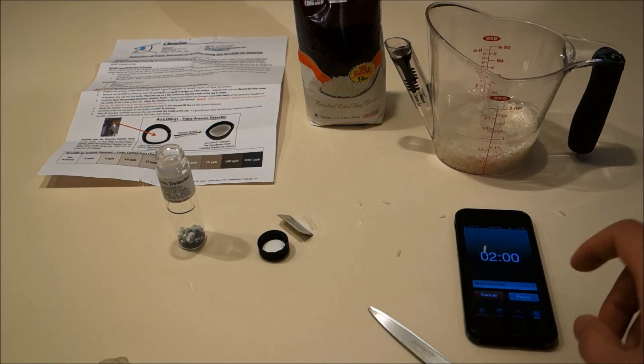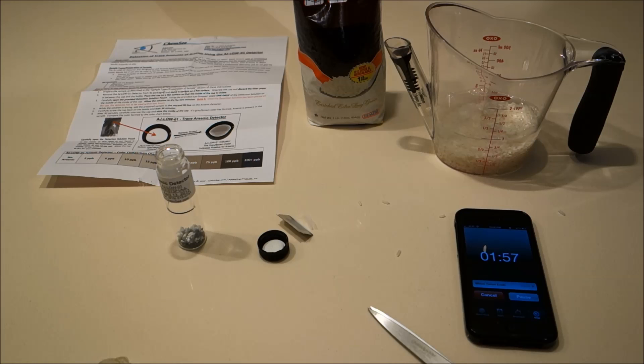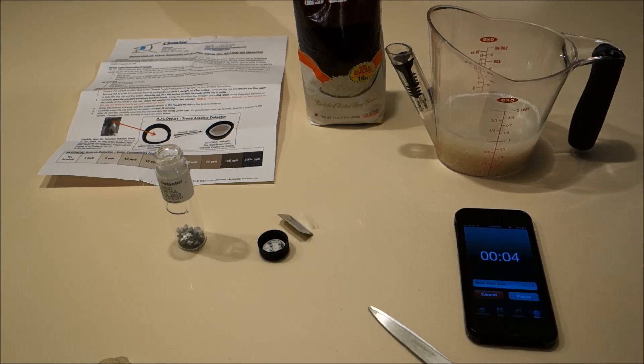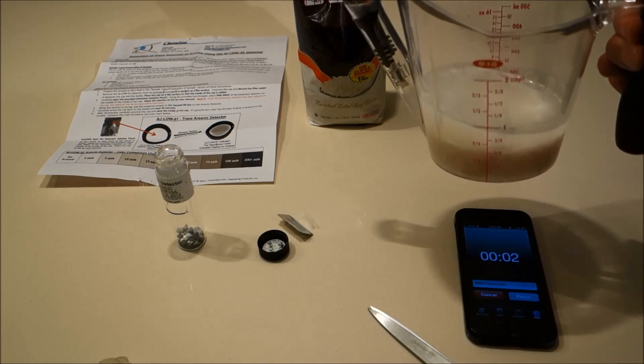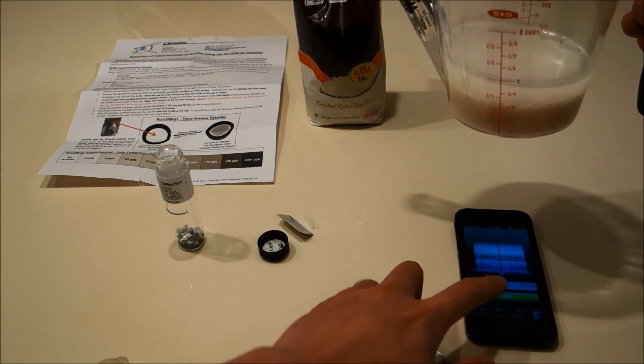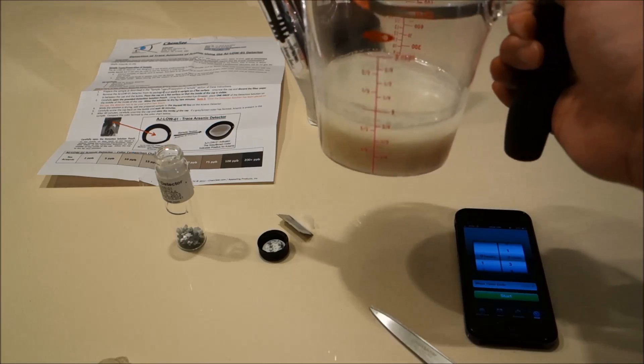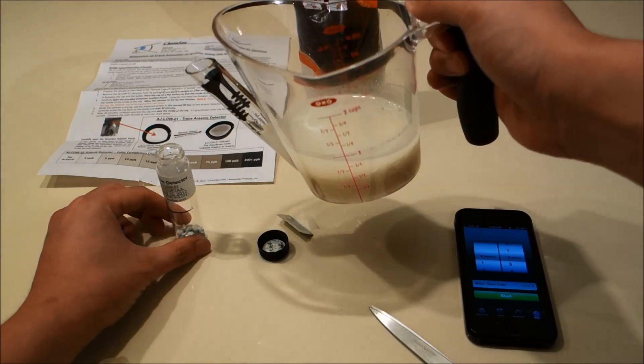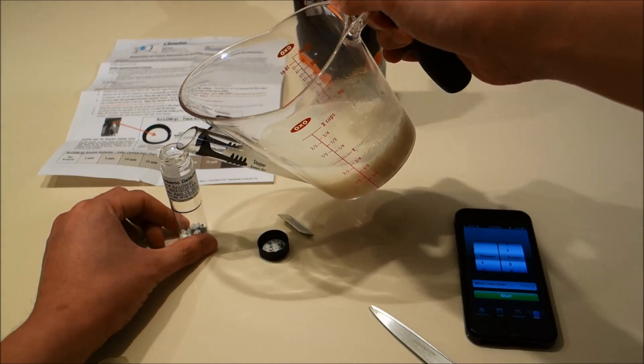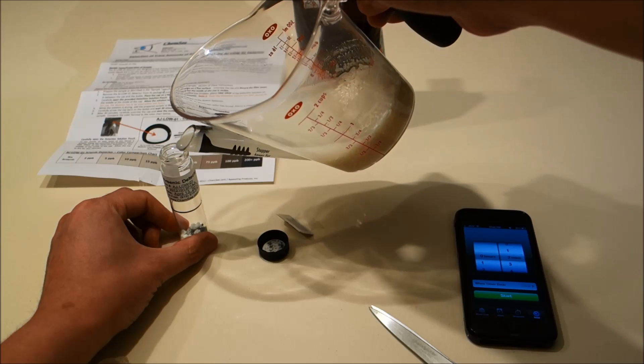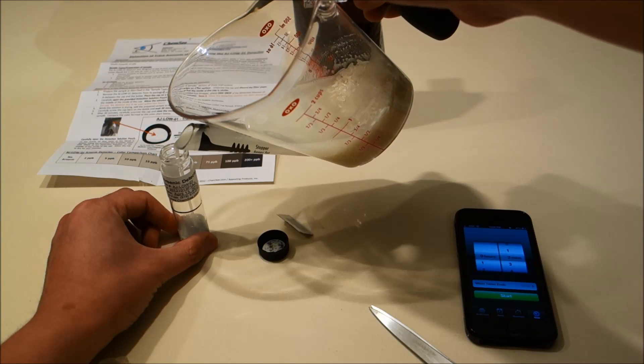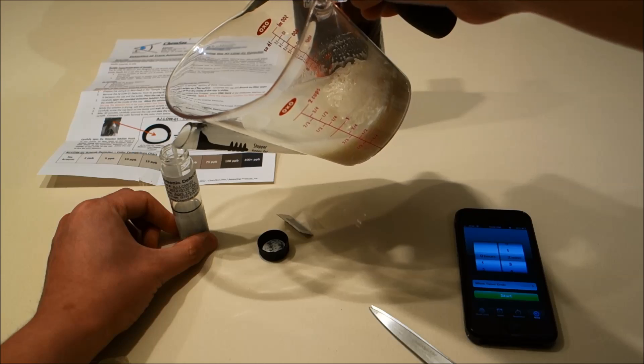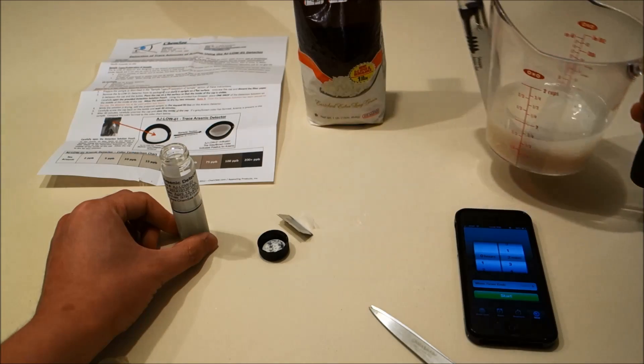Now we're going to wait about two minutes for the solution to take effect. Okay, now that two minutes has passed, we're going to take our solution and fill the vial up to the black line with just the liquid from the container.